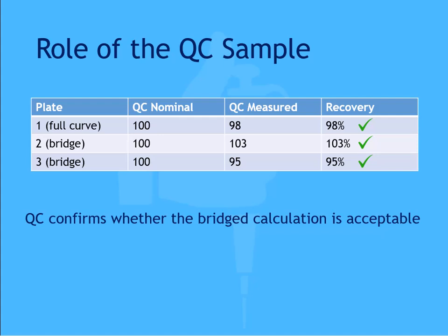The QC sample is compared against the predetermined criteria, and if the result falls within the acceptance limits, this supports accepting the plate. If the QC fails, the plate should be reviewed or rejected according to the assay protocol. Acceptance thresholds should be defined by the user's validation requirements, internal procedures, or regulatory expectations where applicable.